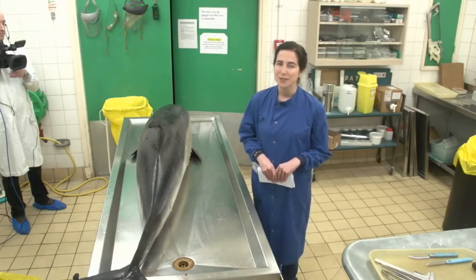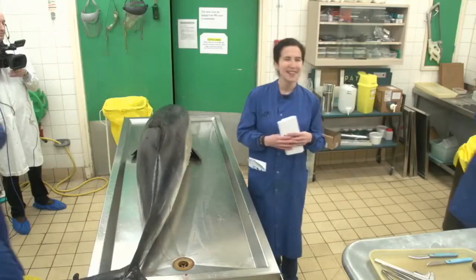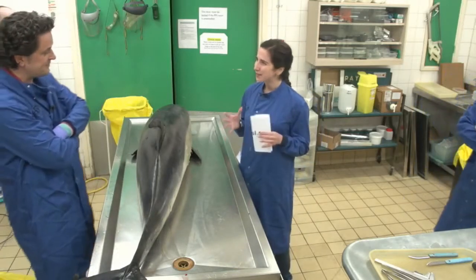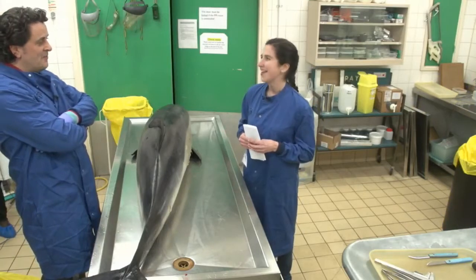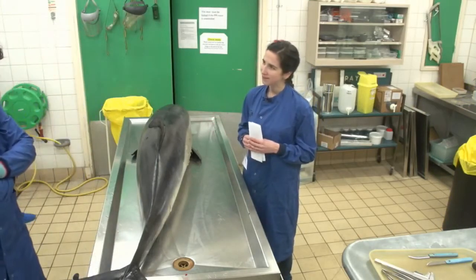Because I am joined by Rob Deville and also Matt Perkins, who appear to be in different areas of the room right now. So come together. But Rob, you are the project manager of the Cetacean Strandings Investigation Programme. I am, for my sins, yes. First of all, what do we mean by the term cetacean? So this is a cetacean in front of us. Cetaceans are a collective name for whales, dolphins and porpoises.